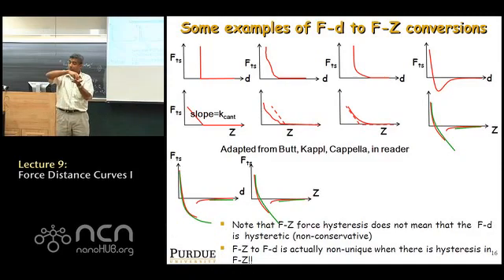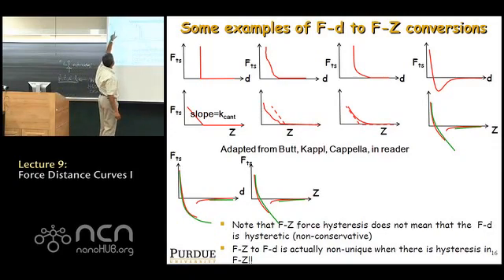So the amount the cantilever bends is simply equal to the amount you move the Z further down. In other words, the slope that you see here in the F versus Z curve is simply going to be the cantilever stiffness. That's it. That's the slope that you see. Because the deflection is going to be the same as the Z that you move on an infinitely stiff substrate.